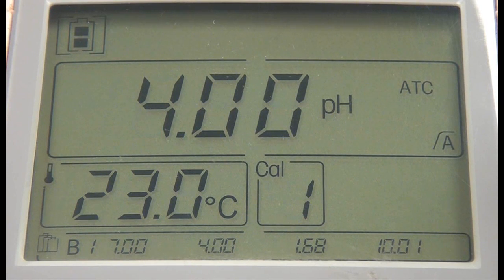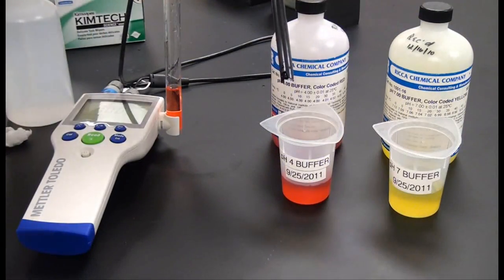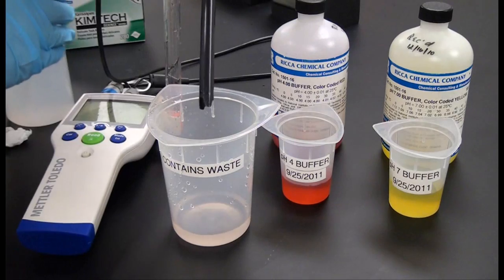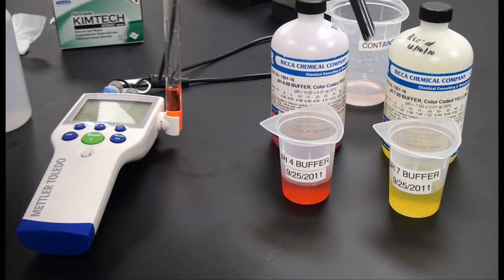After the reading is stabilized, it will show a percentage value of slope. Rinse the electrode in deionized water and place the electrode in the next calibration buffer solution, pressing the CAL button again.